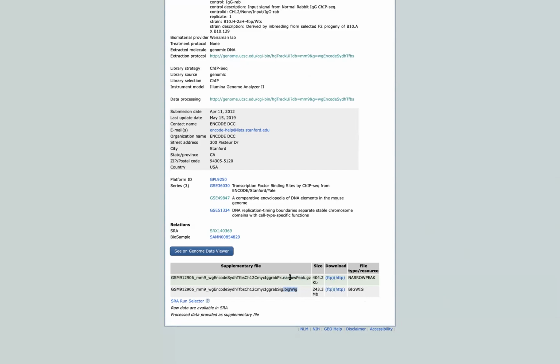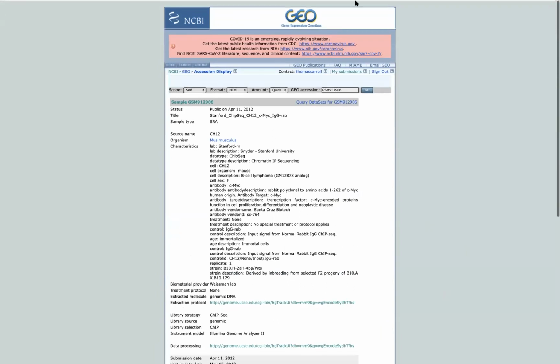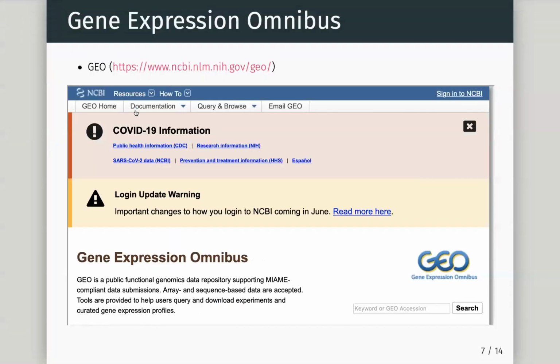And then another file, hopefully we recognize, a bigwig. So these are processed data files. This is summarized position. This is going to be score. There's no raw data there. Okay, that's because raw data for GEO now is held somewhere else. So even though you may submit your data to GEO, you will go there and do the submission.